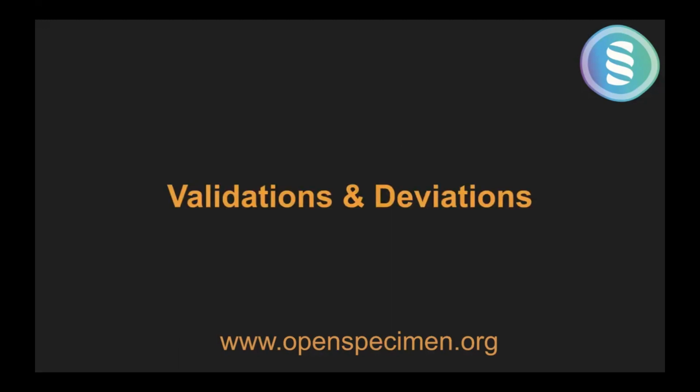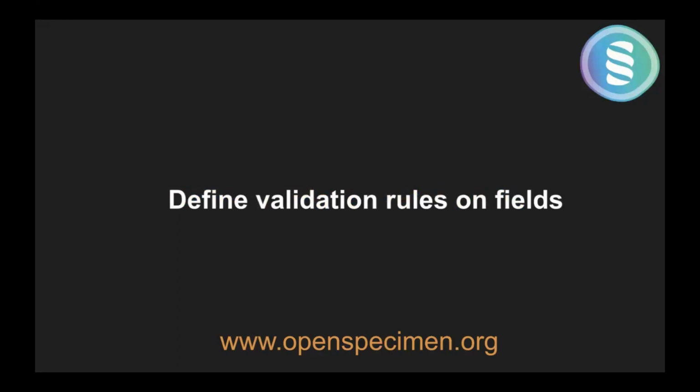Okay, I talked about validations and deviations, which is basically, you can define things like the number has to be within a certain range, dates have to be within a certain range, those kinds of things. Or you can define validation on the whole task. You can say that this task as a whole cannot be skipped. Therefore, if they have to skip, they'll have to define why they skipped it. So you can define very specific validation rules on each field.